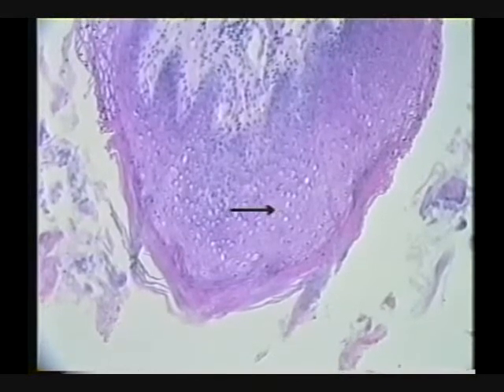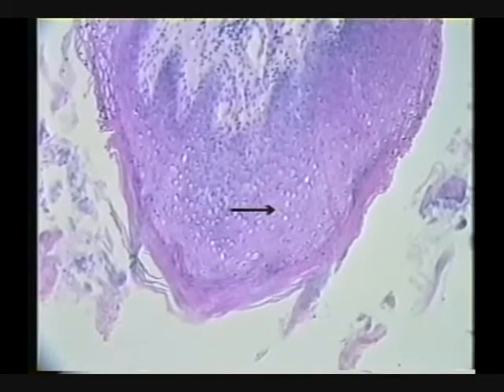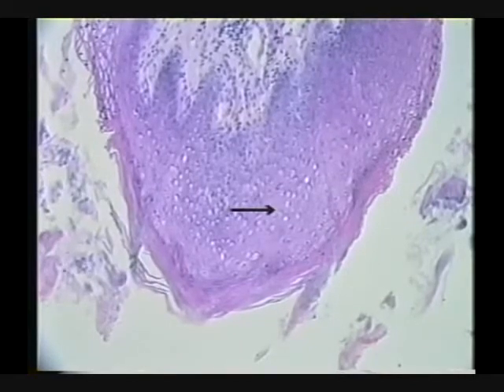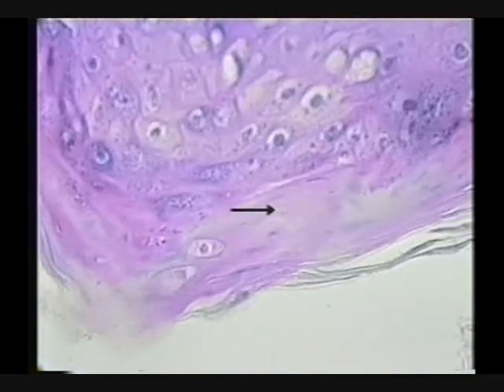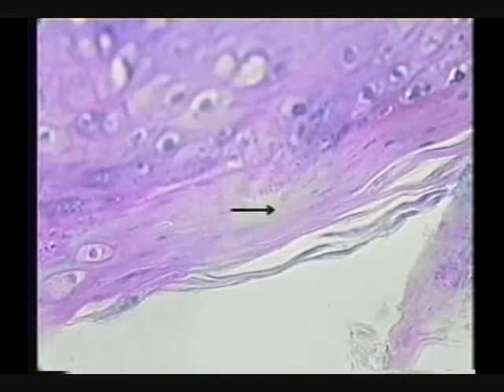Keep moving down here. Identify the tissue occupied by the pointer. You sound like a bunch of little parrots. Did you look at it? It looks keratinized, doesn't it? Okay, let's get up close. What do you think? It's keratinized, isn't it? Why? Okay.